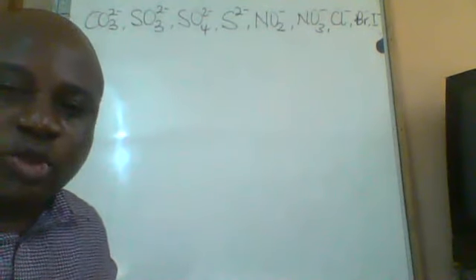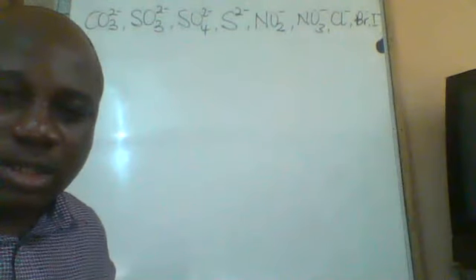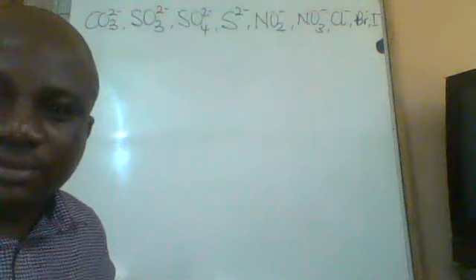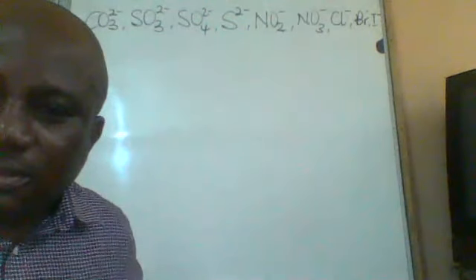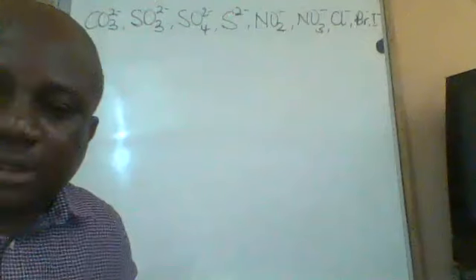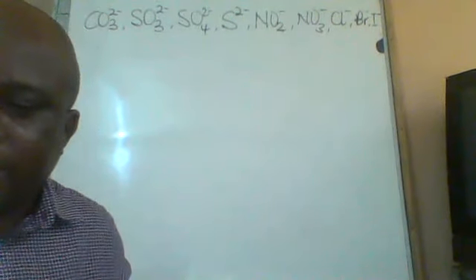What are the 3 things you have to note when a gas is involved in the course of the test? Ken, do you remember? Sir, please no. Oh, are you sure? When the ammonia gas was coming out, there were certain 3 things observed about the gas.